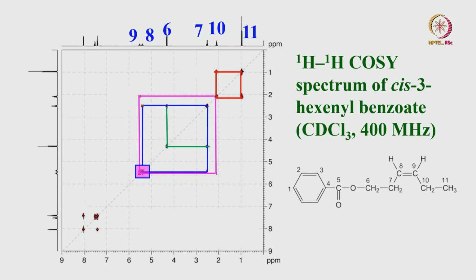From 7 on the diagonal, come down, hit the diagonal and complete this square, so this has to be proton 6. That completely analyzes this bunch, and we can make the assignment without any difficulty. But what is left over? Only the phenyl part. In the phenyl group, of course, 1, 2 and 3 I can simply assign based on the intensity pattern.